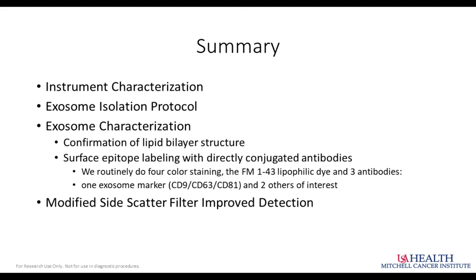We strive to have that tube of blood in our hands within 30 minutes of it coming out of a patient, spin it down, and we immediately add a standard protease inhibitor tablet to a certain concentration, whatever is recommended. I'm not even sure where we get ours from, but that's a pretty standard thing. But we've done this side by side.